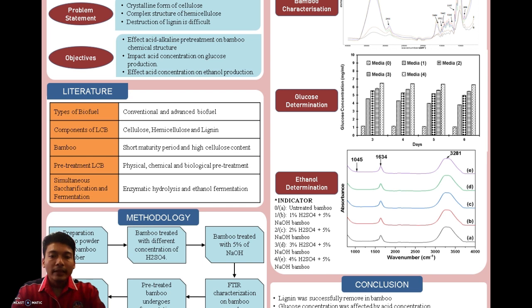The effect of residence time for fermentation on the concentration of glucose in the sample has also been discussed. It was discovered that there was a slight decrease in the amount of glucose. The change in glucose concentration for all the samples was too small, which is less than 0.5 mg. Since the change was so small, it was concluded that there was no change in glucose level for all the samples. Supposedly, the glucose level in the sample should decrease tremendously as the residence time of the fermentation increases.